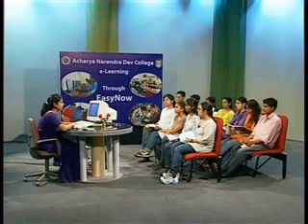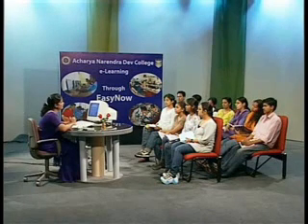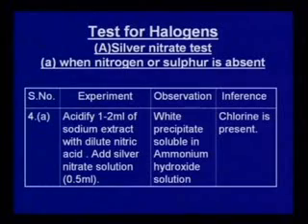Then the silver nitrate test. As I told you, you can perform the silver nitrate test in 2 ways. Till this stage you know whether your compound contains nitrogen or sulfur, so you can decide which path to follow. If your compound contains nitrogen, you follow one path. If your compound doesn't contain nitrogen and sulfur at all, you perform the different path. Whatever path you have followed, you have to record only that part, not the other part.